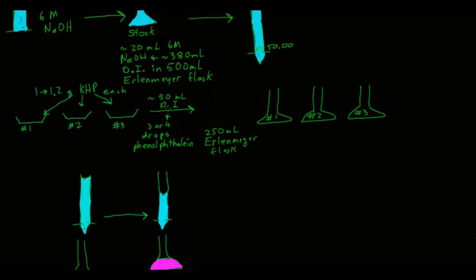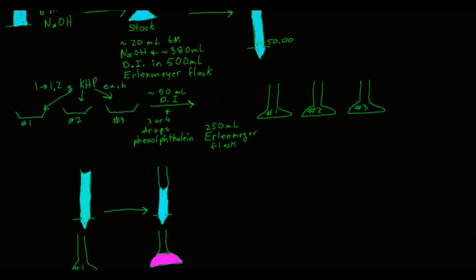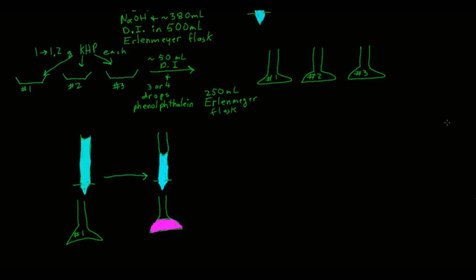Once you've done that, add about 50 milliliters of DI water to each of the Erlenmeyer flasks using your graduated cylinder, and about three or four drops of the phenolphthalein solution. Then swirl the flasks to make sure they're mixed well and to dissolve all the KHP.